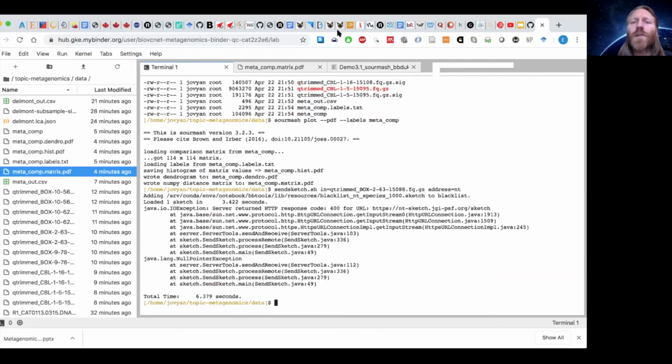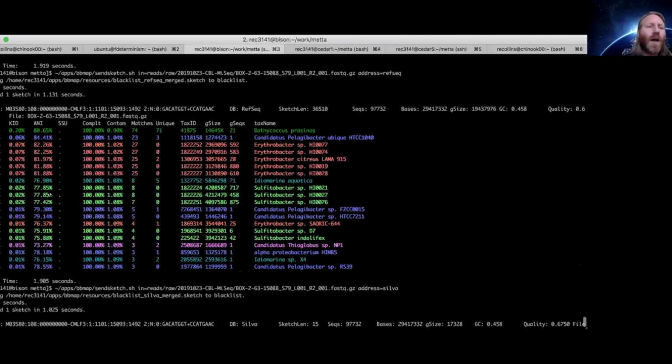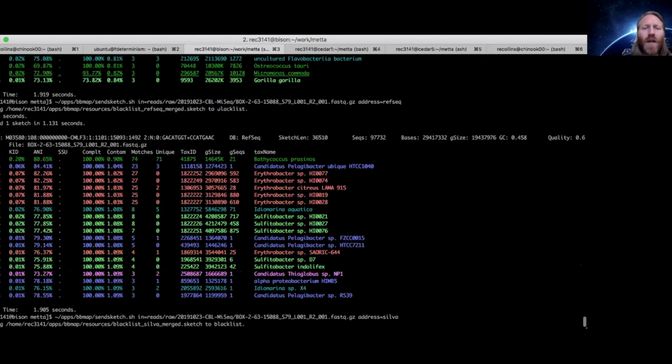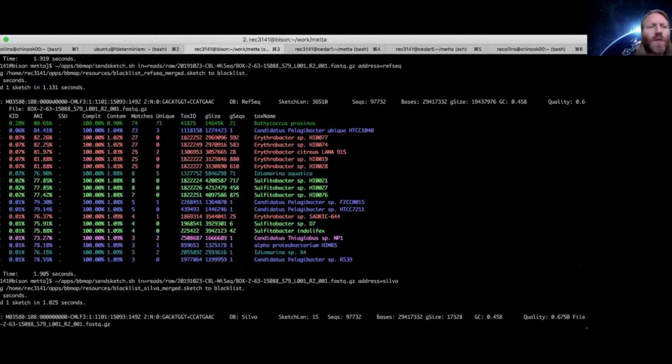So I'm going to share my other screen. So this is the output from SendSketch, which I ran on my own terminal.